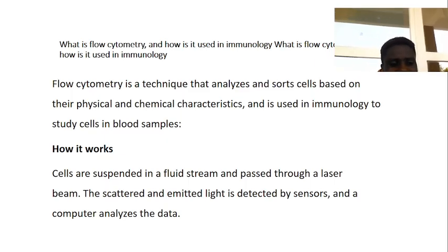How does it work? The flow cytometer is used to separate cells depending on their volume, size, and what is inside the cytosol.